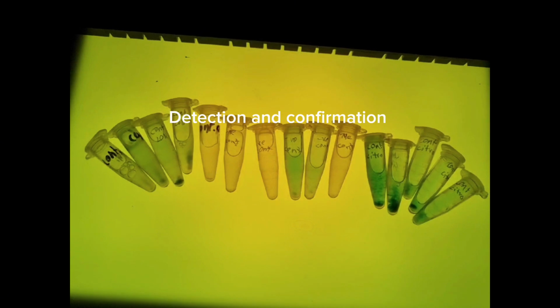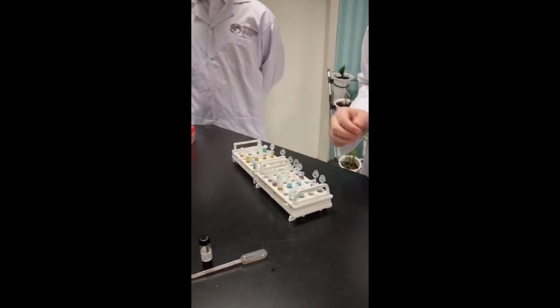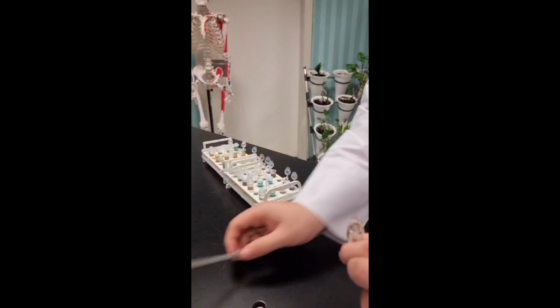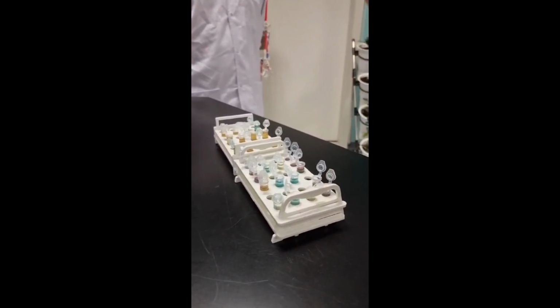Module 2, we're focusing on detection and confirmation. First, we begin with observing color changes in samples for coliform presence, then using UV lights to confirm E. coli presence, and then adding indole detection reagent to the tubes and looking for red ring development to confirm E. coli. This module requires specialized equipment such as a UV transilluminator, UV safety goggles, and indole detection reagent.